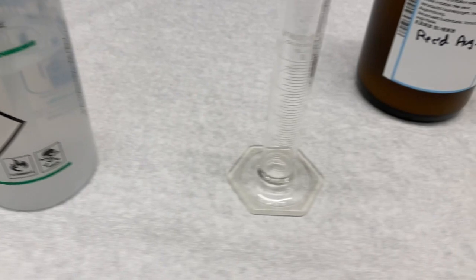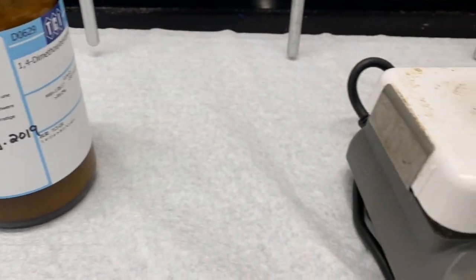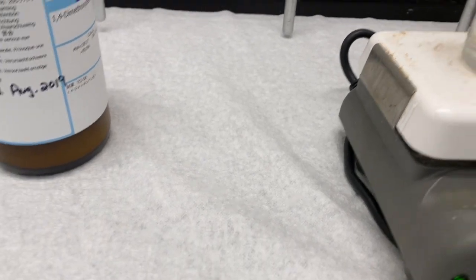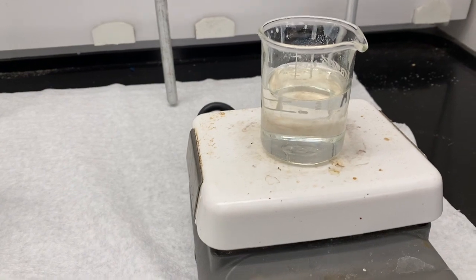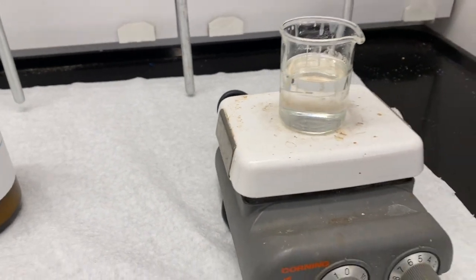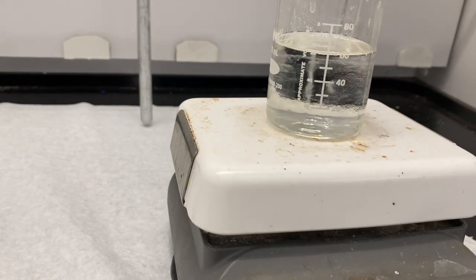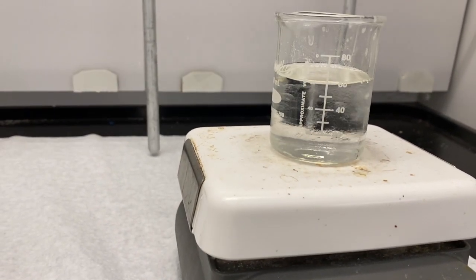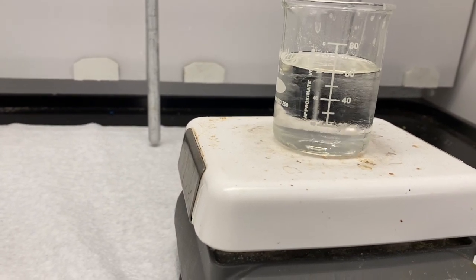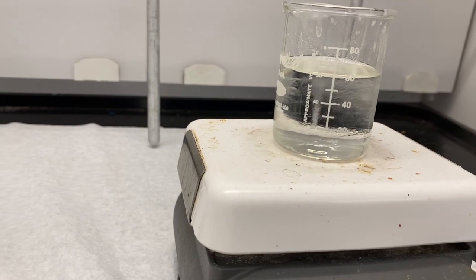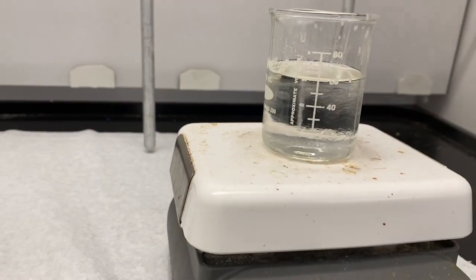And so we're going to put this onto the hot plate. And we're going to recrystallize this. We're going to boil this solution until we've got about 15 milliliters left. And then we'll let this solution cool slowly by removing it from the hot plate to hopefully produce nice crystals.